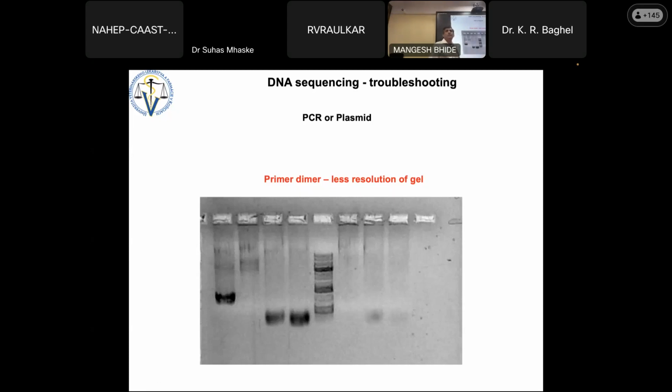There is no good separation between 500 and 100 base pair, so you think there is some product, you cut and send, and there is no result.